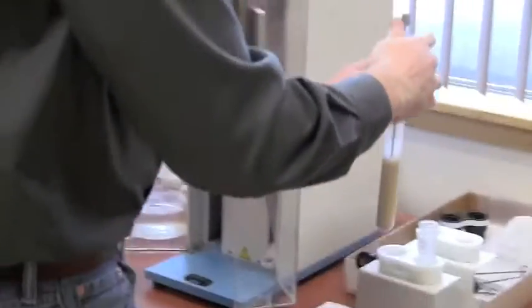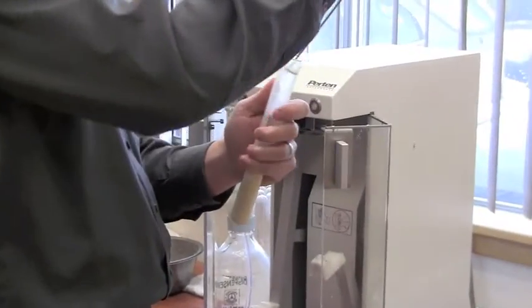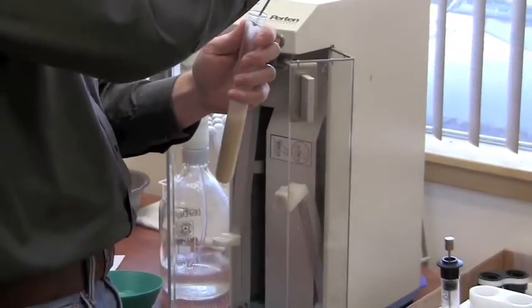According to our procedures, he has 40 seconds from the time they come out to scrape them and get them into the falling number machine, into the bath.